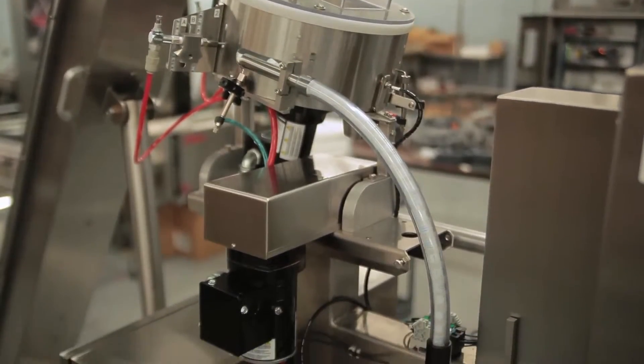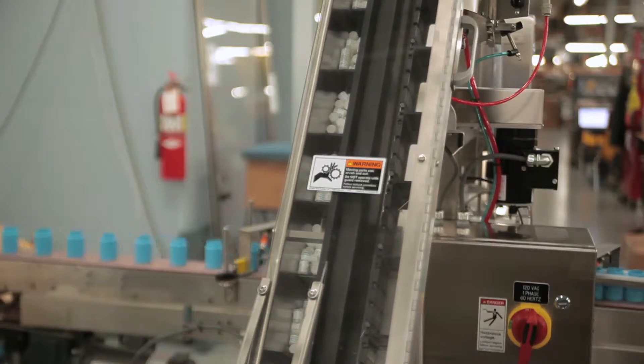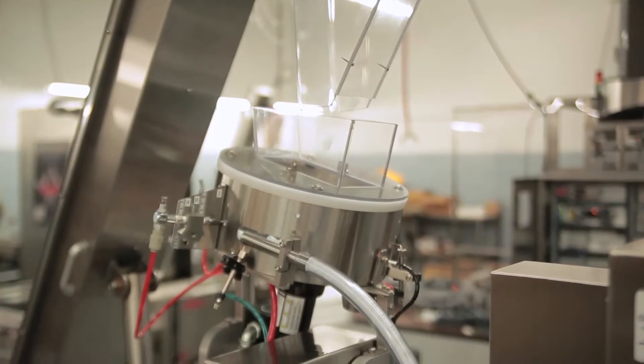When a sufficient number of canisters are detected, the hopper elevator is signaled to start and stop automatically to consistently maintain the right amount of canisters in the disc sorter.